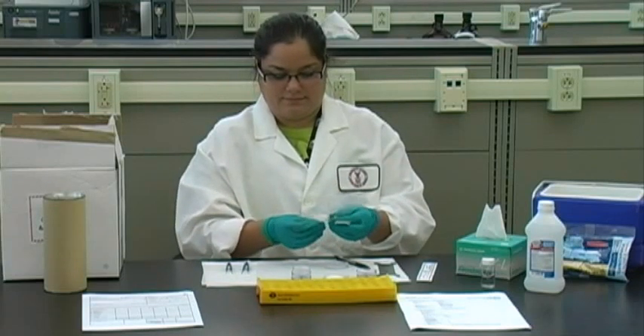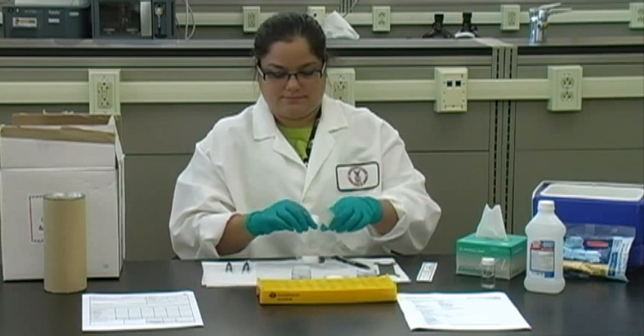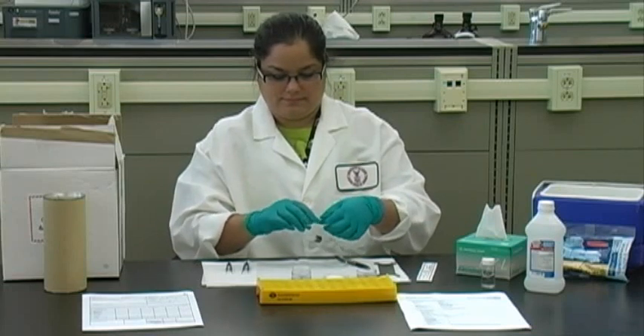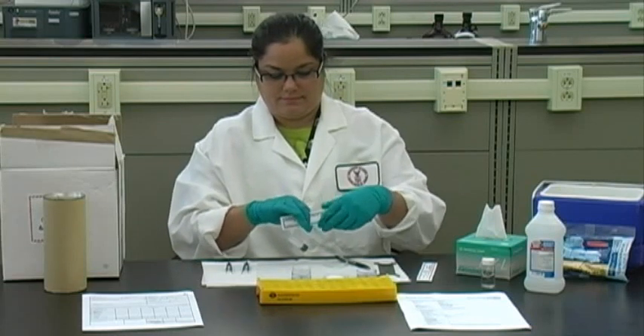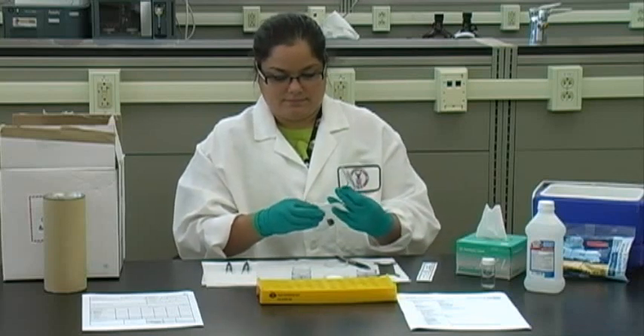Perform the extraction procedure separately for each sample. Wear a new pair of gloves for each sample. Your field blank will be treated the same way. Extract a blank sample the same way as the air samples and submit it with your samples.